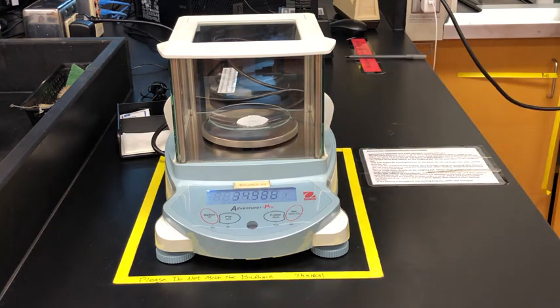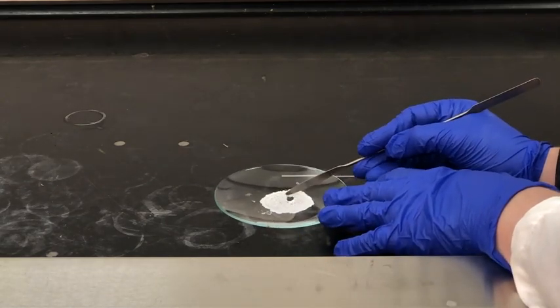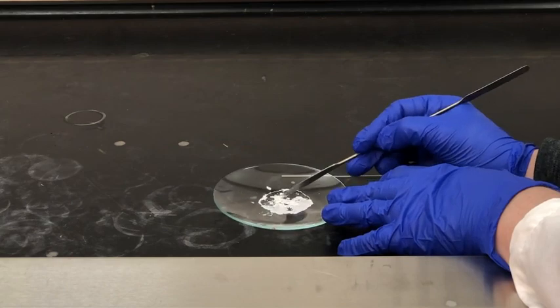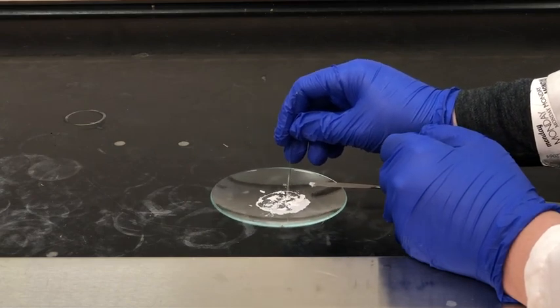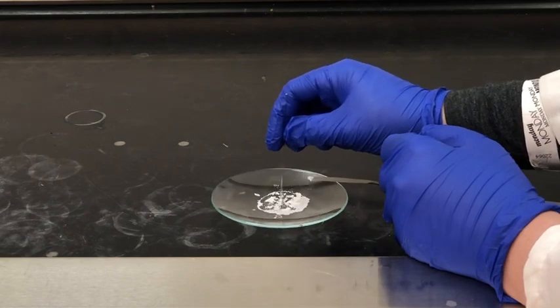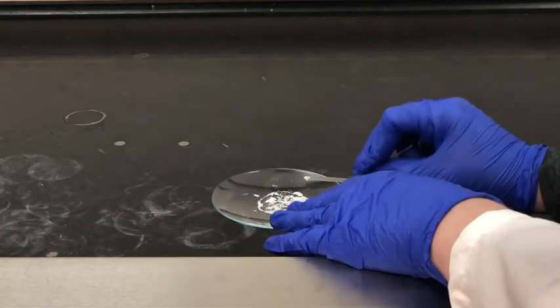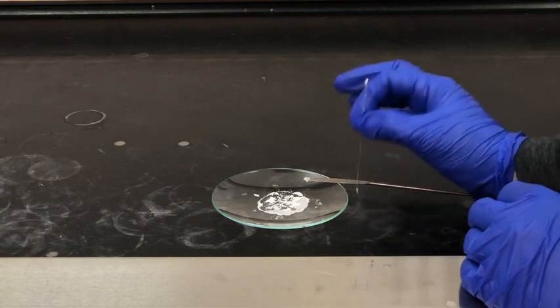I've zeroed the scale and placed the watch glass with the aspirin on it, and we're just going to take note of the mass of the two combined. Next I'm going to prepare my melting point capillary — it's a little hard to get any sample when it's dried onto the watch glass, so I'm going to break up the solid a bit to make it easier to prep the capillary. I'll tap my capillary tube into the sample — you only need a little bit for a melting point experiment. Once I have enough in my capillary tube I'll turn it over and tap the closed end on the countertop so the solid falls to the bottom.